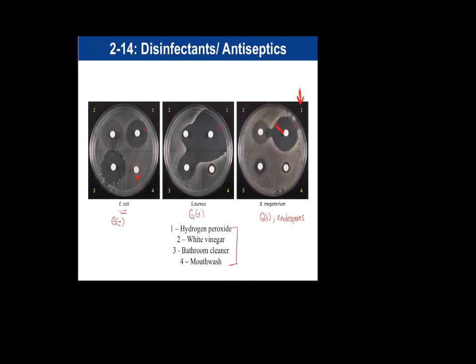mouthwashes and toothbrushes and things of the dental sort are kept in your bathroom. And E. coli is frequently deposited into toilets in the bathroom. I have run into people that have stored their toothbrushes in mouthwash upside down to disinfect their toothbrush in between uses, or they just store it in mouthwash.